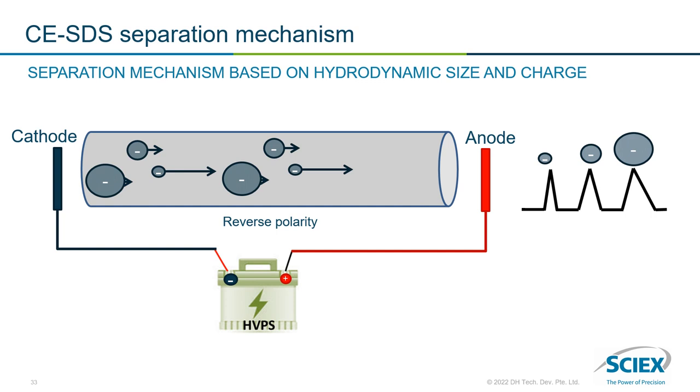As previously mentioned, the protein separation is achieved by capillary electrophoresis and molecular sieving. The capillary is filled with an entangled polymer solution that is replaced for each sample, which improves reproducibility and prevents sample carryover. We then introduce our SDS-treated protein sample and apply voltage. Once the voltage is applied, proteins migrate through the gel matrix, in order of increasing size, in the direction of the anode. Reverse polarity, negative to positive, is utilized along with UV, PDA, or laser-induced fluorescence detection, depending on the specific workflow.